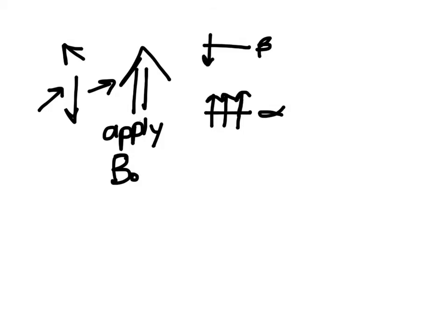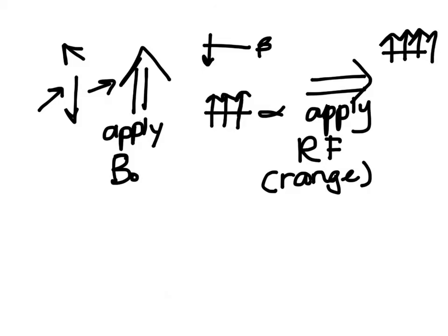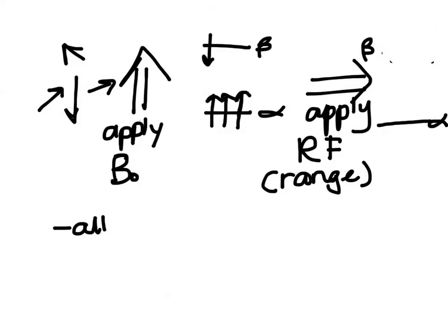Now what we can do is we can apply radio frequency, and this is going to be a range of radio frequencies, and that will promote, when we hit it with the right energy, some spins to be misaligned, to be opposed.